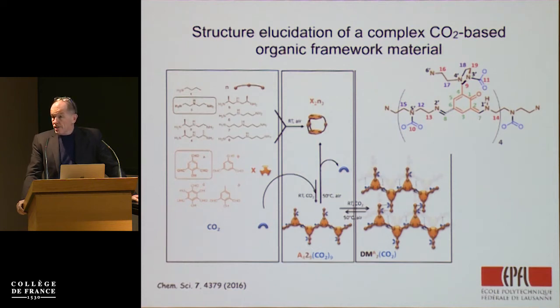I'm going to try and talk about systems to illustrate where solid-state NMR is. I'm going to try and talk about systems that might be of interest to you. And so last night we were talking, and I get the impression that we're not quite sure what porous means, and I guess that's one of the points of Clément's introduction as well. So this may qualify. It's a coordination polymer that takes up CO2. One of our colleagues in Lyon developed this and couldn't solve the structure by any other method, and that's usually when they come to us. So these are very difficult problems.